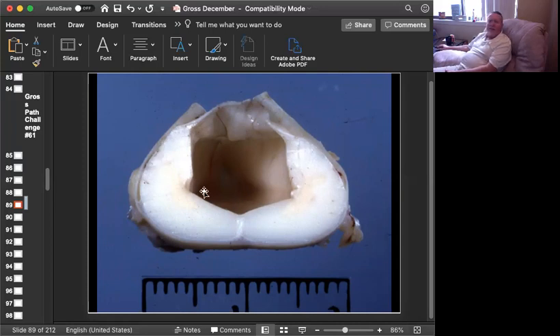There are a couple of terms that you use when we're talking about fluid-filled cavities or cysts within the spinal cord. The first is hydromyelia, and all of these probably have something to do with interrupted CSF flow and accumulation. There's too much CSF, it's not circulating properly. Hydromyelia is when you have too much fluid in the central canal, but it's just the central canal. Central canal will expand, it will get too big. You have necrosis of the gray matter around it. But that's fairly uncommon. Okay, this is more than a central canal. It's expanded. There is a large cyst that is dorsal to that. So this becomes a condition known as syringomyelia.